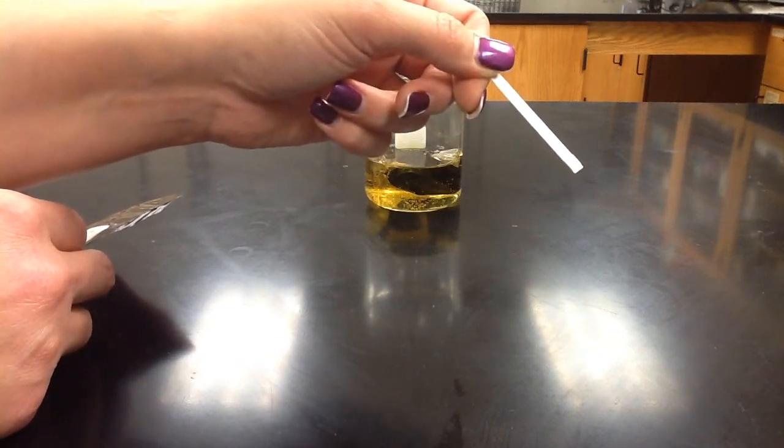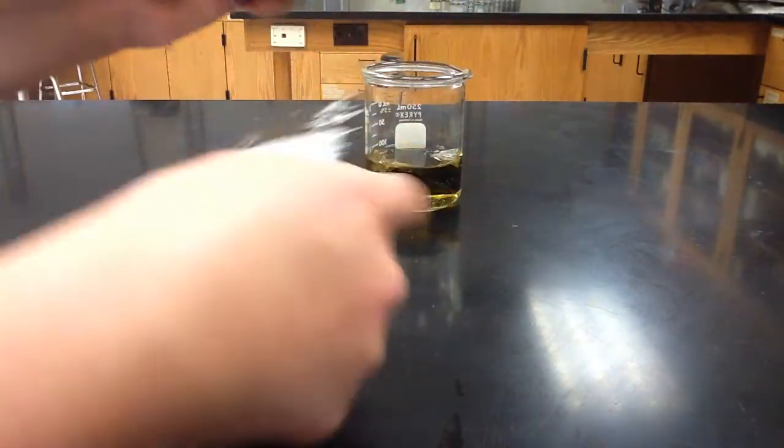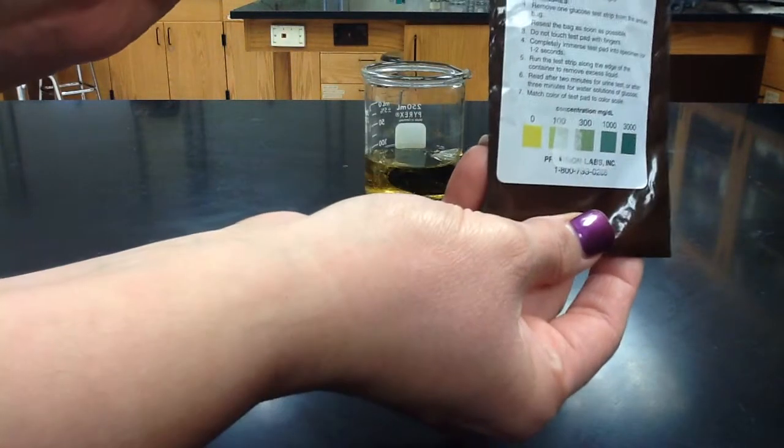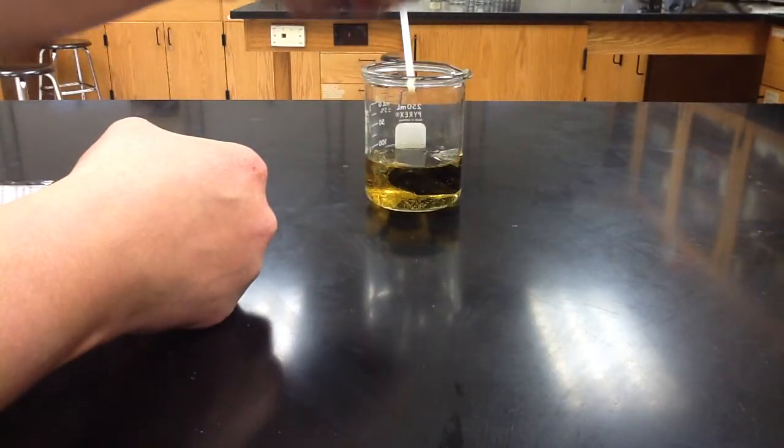Glucose test strips are yellow when you first get them out of the bag, and what the indicator tells you is that if it turns green, that means there's glucose in the solution.